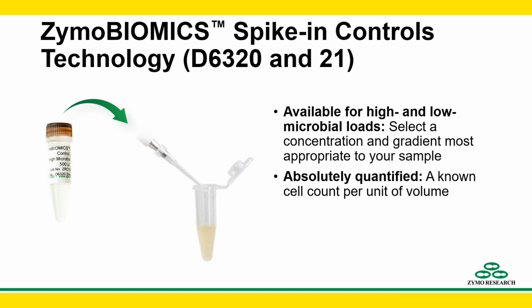These are absolutely quantified, so these are created with an absolutely known cell count per unit of volume. And I'll talk more about this later, but this gives you a little bit of ability to have a microbial yardstick to compare to.